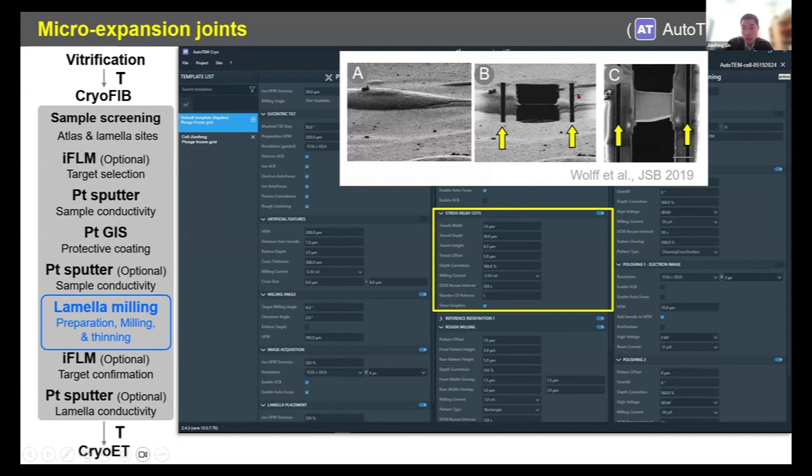If you don't cut this, the tension will squeeze the sample and make the lamella bend. If the lamella is bent, it is really difficult to get a really thin lamella, and the pattern will cut your lamella away and break it. So this is really useful for high quality lamella, especially if you are aiming at a wide lamella, more than 10 micrometers. Generally this is not needed.